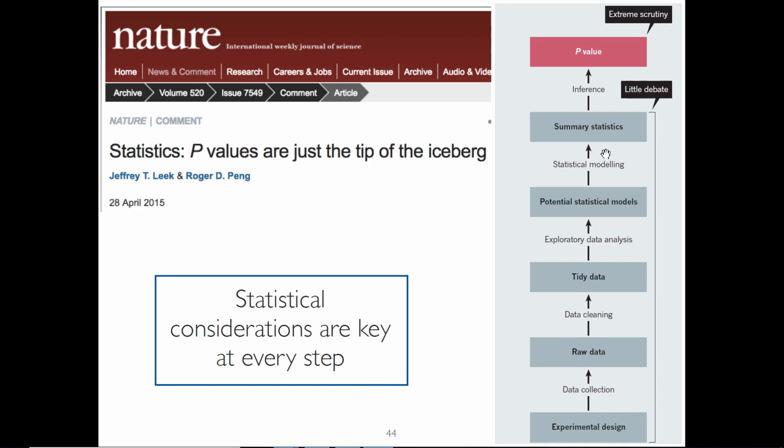We did a database search. We did peak detection, quantification, and so on. We created a report, which we could read, for example, into R. We specified some modeling assumptions. And then we did some analysis to get the p-values, and then we adjusted the p-values for multiple testing. And we get the result we don't like. So is it the fault of the p-values, or is it the fault of the entire procedure?